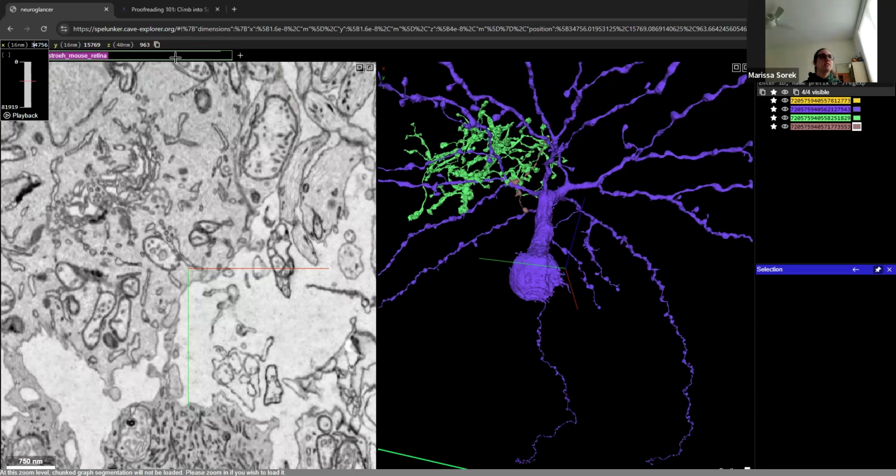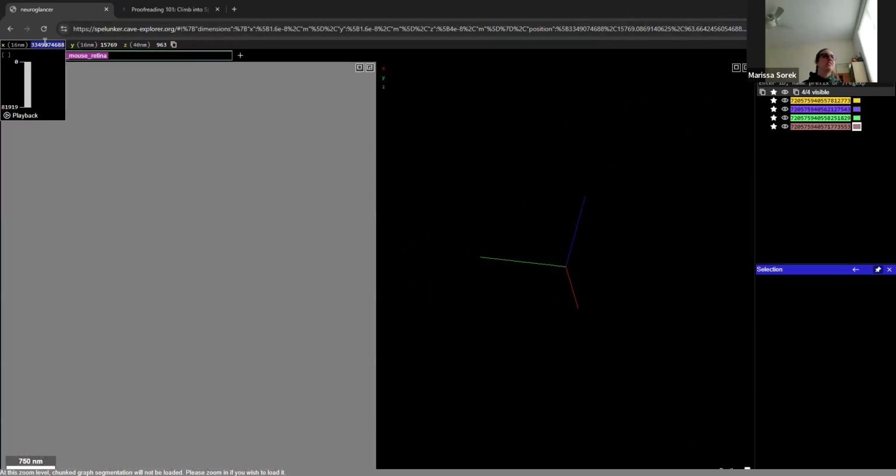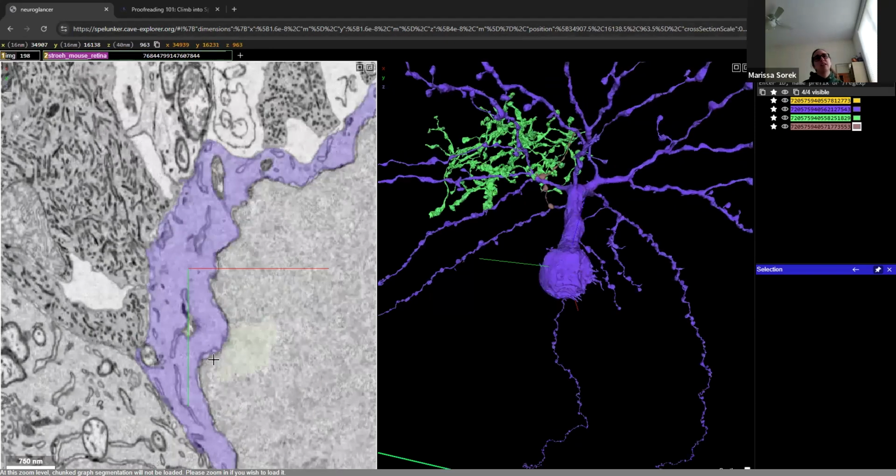These are editable here. So if I just hit Control V here and hit Enter, it'll jump me right back to that spot. So very handy like that.